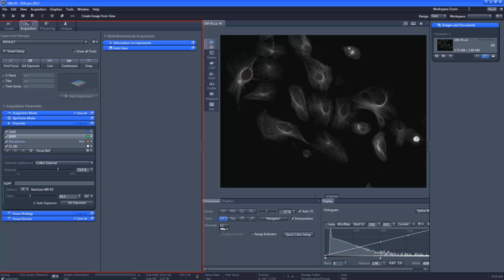In the central window, we have the image itself, with tabs down the left-hand side that allow the user to display the image data in various manners. In the bottom quadrant, we have the post-acquisition modification tools, meaning that we use these to change the image after it is acquired. Here we can find the scale bar tool, crop tool, simple measurement tools, and the histogram, to name just a few. Finally, on the right-hand side of the screen, we have a list of thumbnails of acquired images. This provides the user easy access to acquired data and tracks what data has been saved.